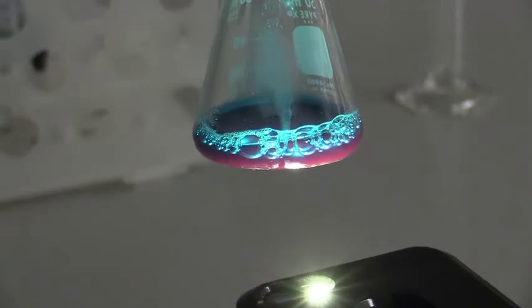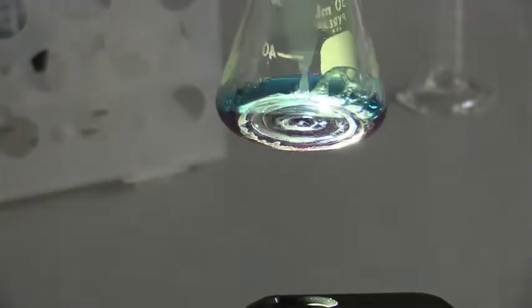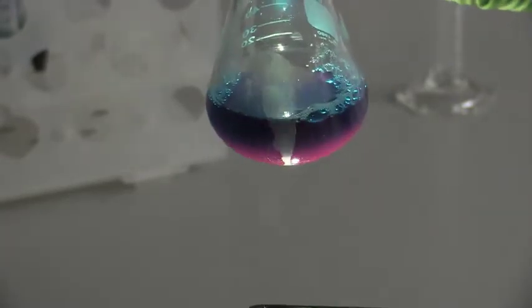In order to see if the protein is in its folded state, we shine a light on the sample, and you can see that it's nice and red. The liquid itself is dark blue. When the light is shined on the sample, it turns a nice dark red color.